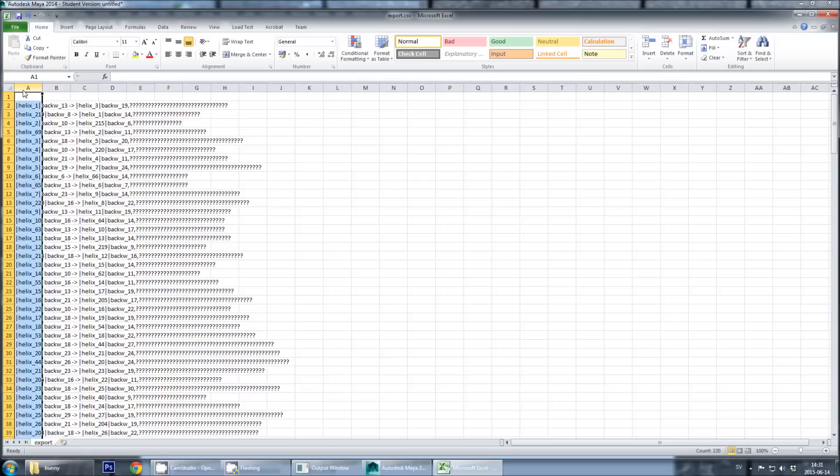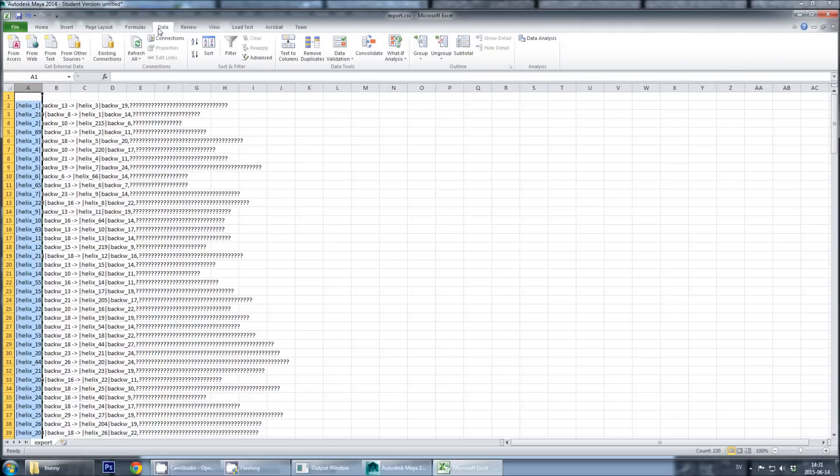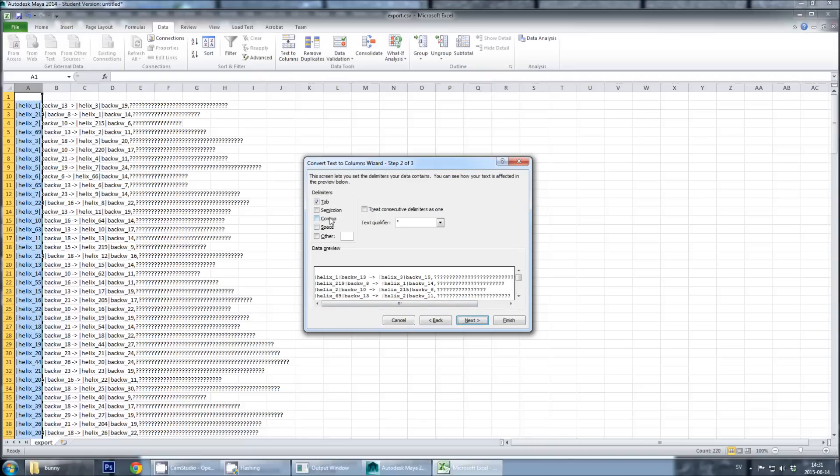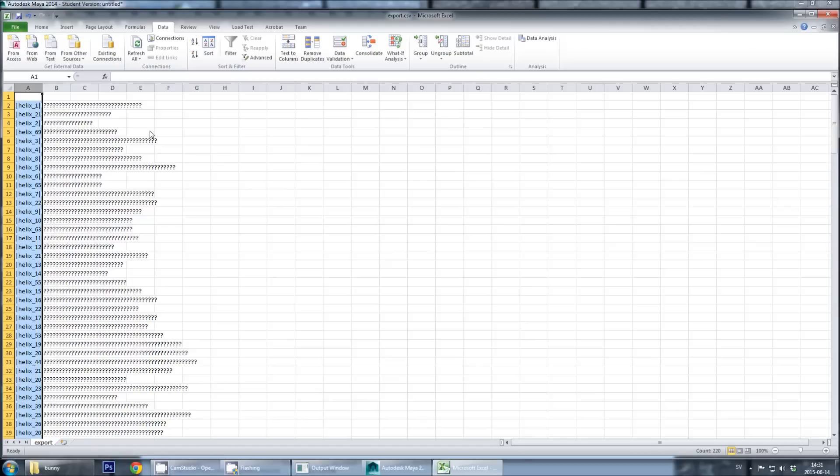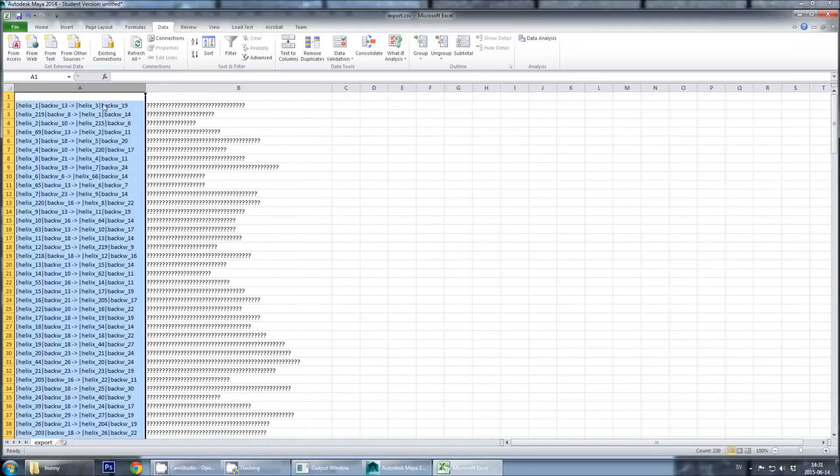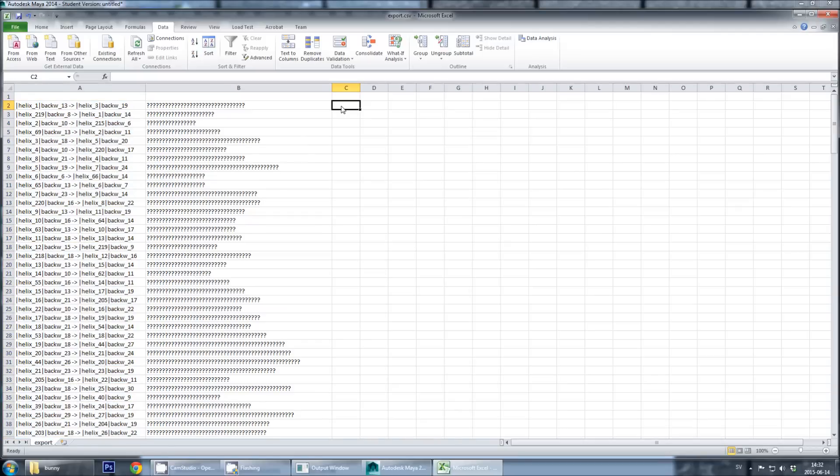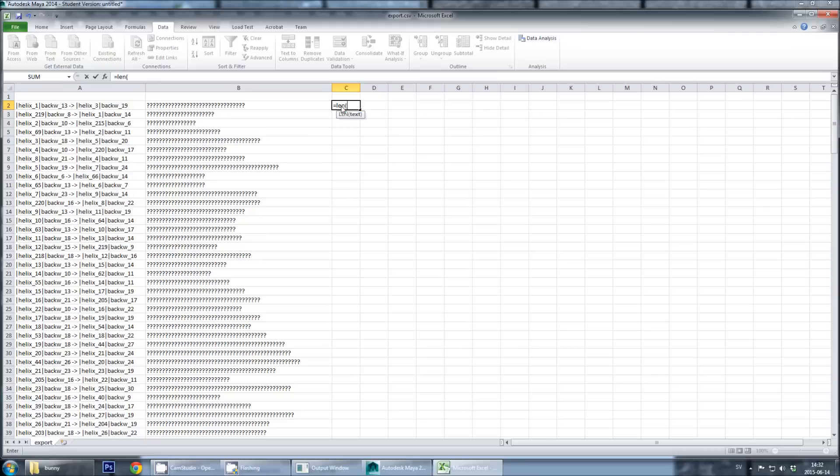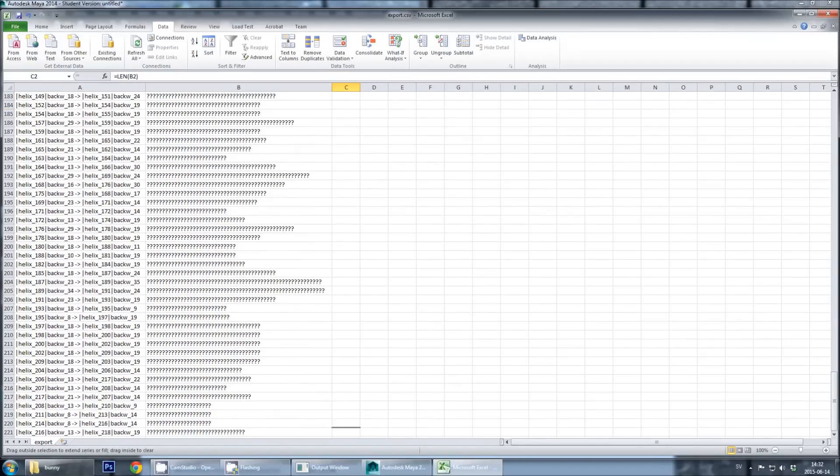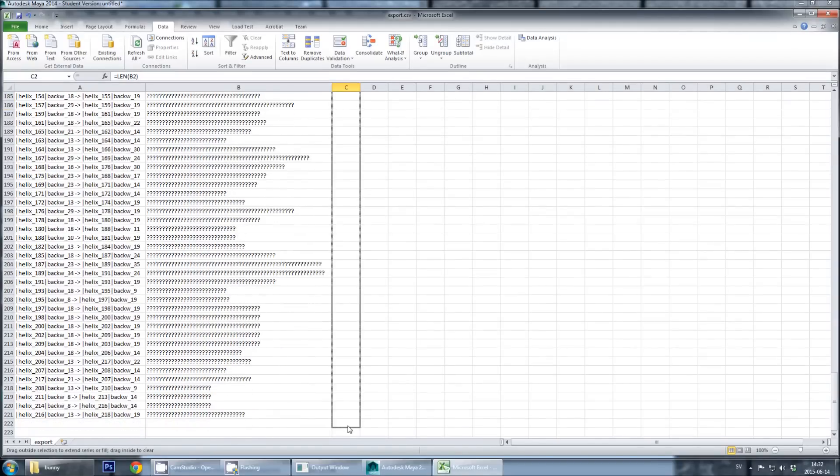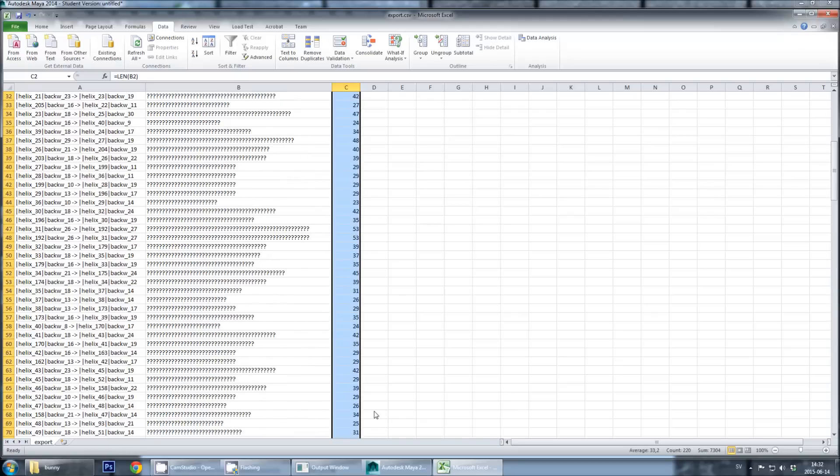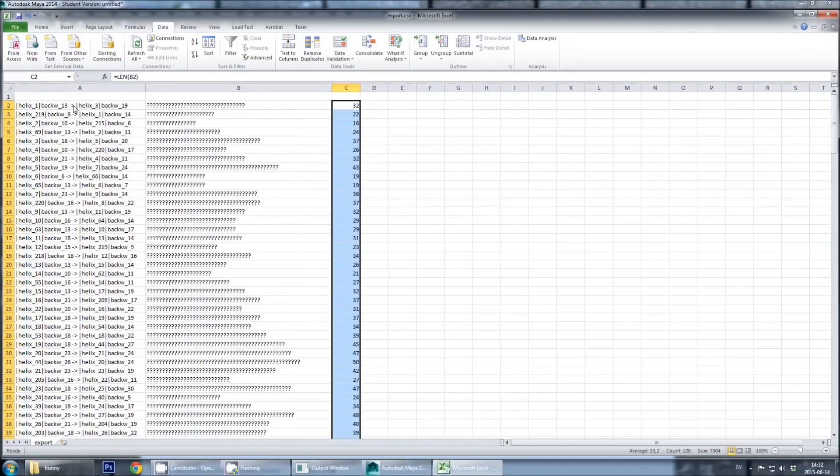And I will delete the first row which contains the scaffold strand. And then I will select column A, use data, text to columns, delimited, and then I will add comma as a separator, and click finish. So, now I have a list of the name of every staples strand and its sequence, which is just question marks. And this may not seem so useful, but it is actually quite useful. If you go into Excel, and you type equal to len, so that's the length of the sequence, which in this case was 32, and then I will just drag this down to get the length of every staple strand.